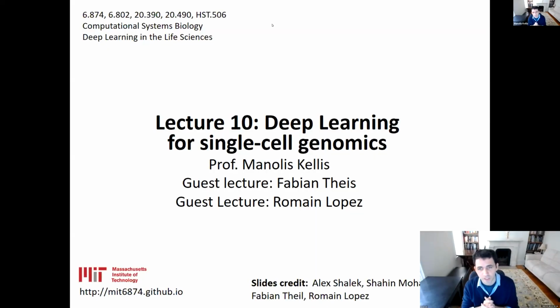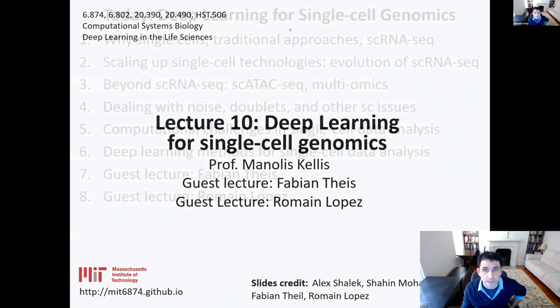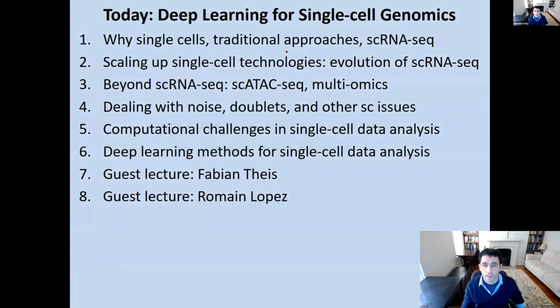So welcome everyone. Today we are diving into single cell genomics, and we're very fortunate to have two guest lectures by Fabian Theis and by Romain Lopez. We're going to talk about why single cells, why traditional approaches don't necessarily work, and how we came up with modern day single cell RNA sequencing.